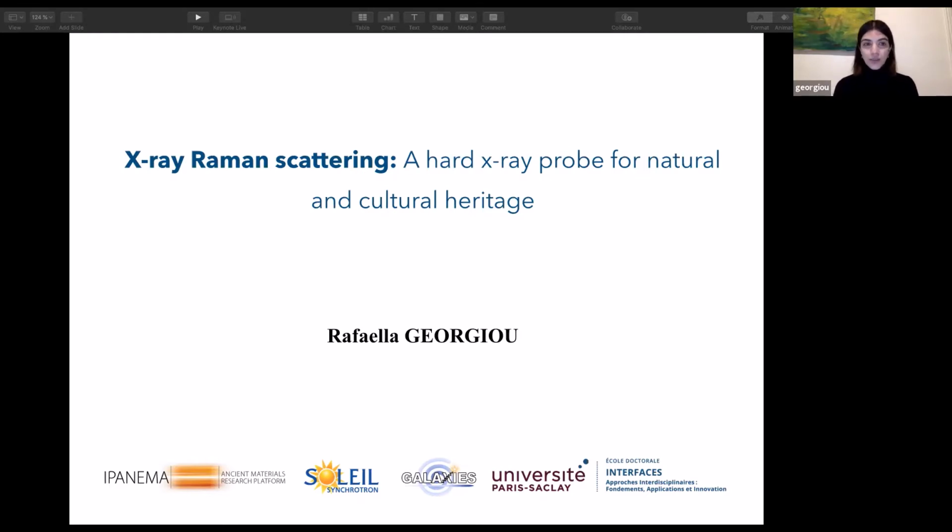So we are going to see and discuss the potentials of X-ray Raman scattering for the study of cultural heritage objects, including natural and cultural heritage objects.